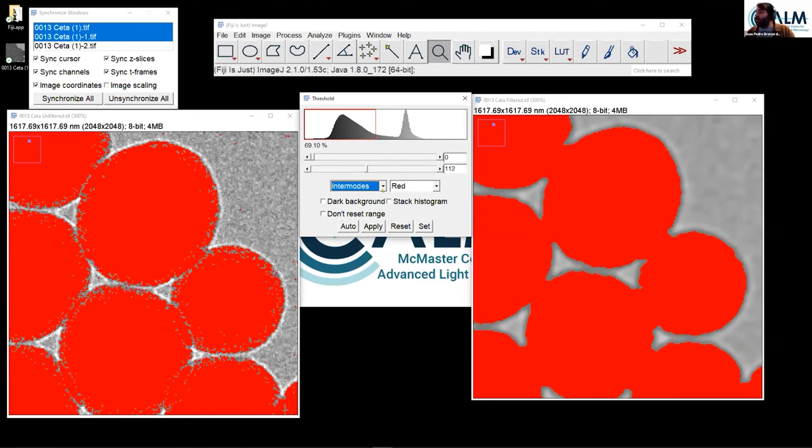You see that as you scroll down and you change the different thresholding method you're applying, your regions get slightly different. Again, especially in these two, you can see you start getting differences among themselves, okay? So again, this one binds them a bit more. This one still gets them very, very close, touching together. This one, for example, the percentile actually allows us to separate individualized particles in this area, for example.